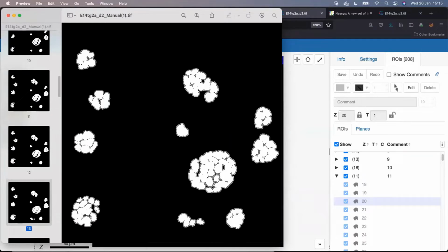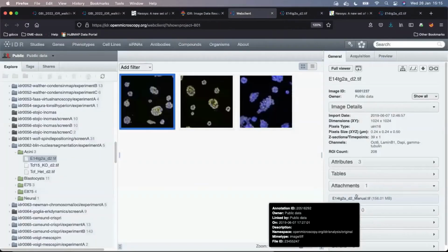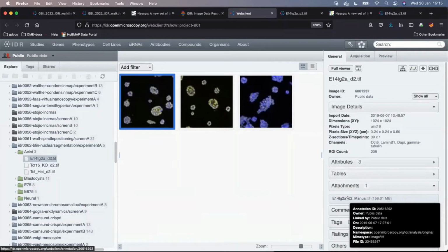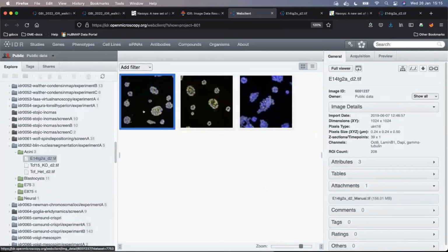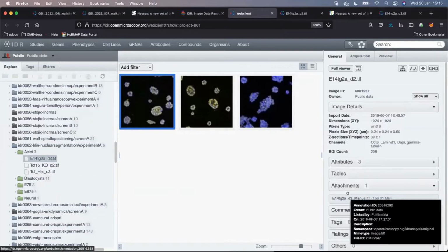So as you can see in Omero, you can attach as an attachment whatever file type you like, which we do in this case, and that file can be an image, but this does not mean that that image is imported into Omero in the full Omero sense, and is thus not a full citizen, maybe it's not the best wording, but I don't know how better to put it. It's not an image in the Omero sense. It's not an object in the database called image.